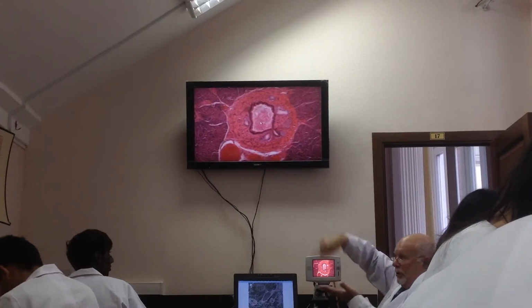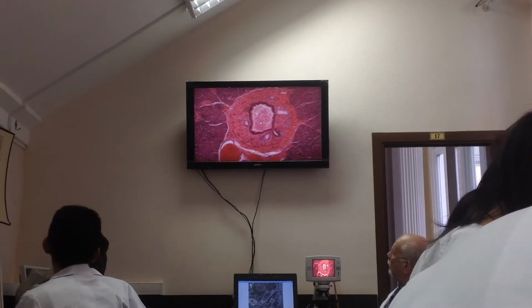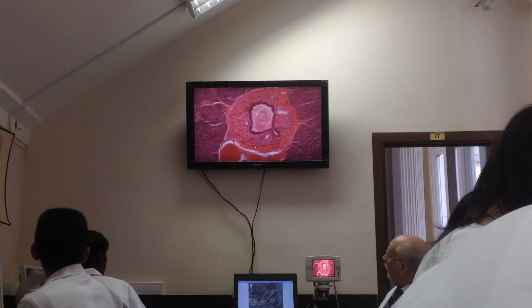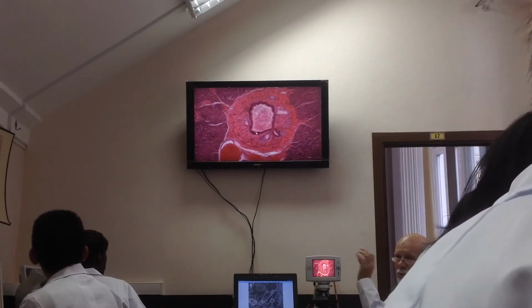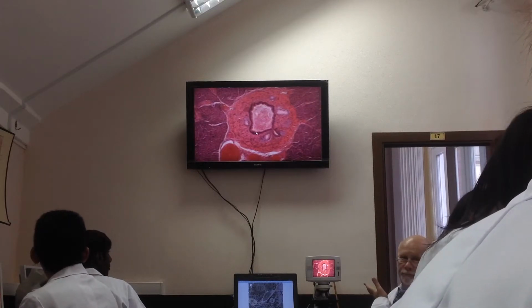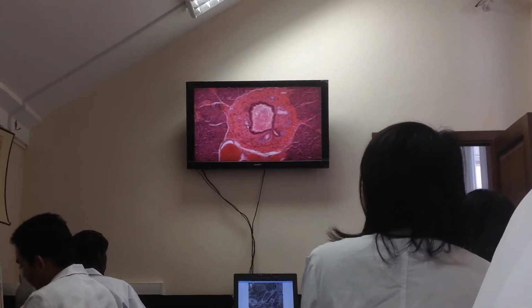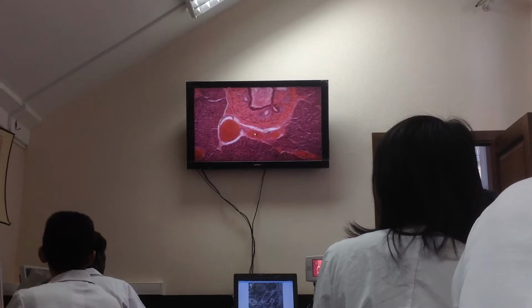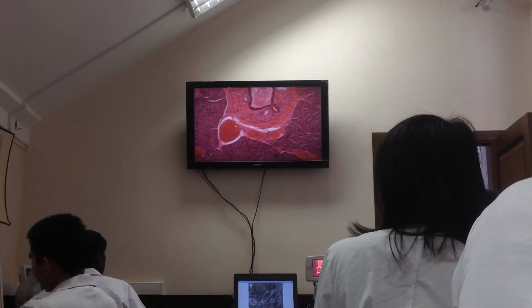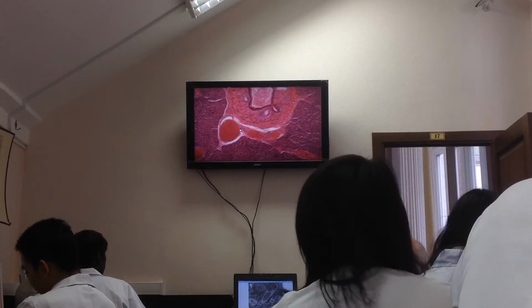Epithelium forms a lining, but you see that in this duct there is not only the epithelial layer, but also its own wall of the duct. Maybe it's a common duct of the pancreas. And blood vessels filled with blood-formed elements, with the erythrocytes. See the difference? Here epithelium, here epithelium. It's easy to differentiate if you know histology.